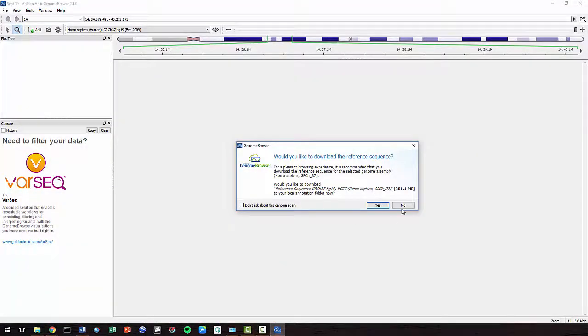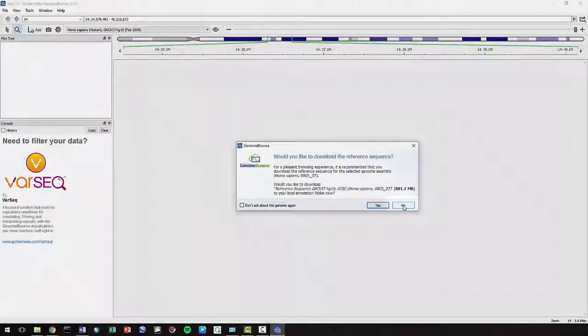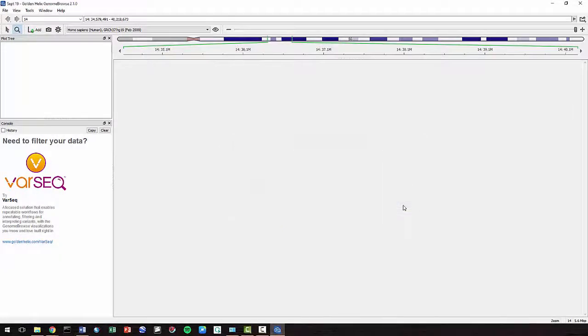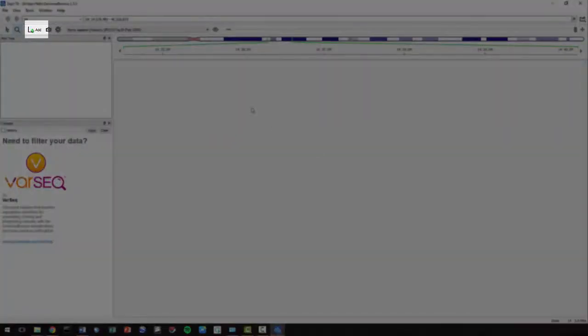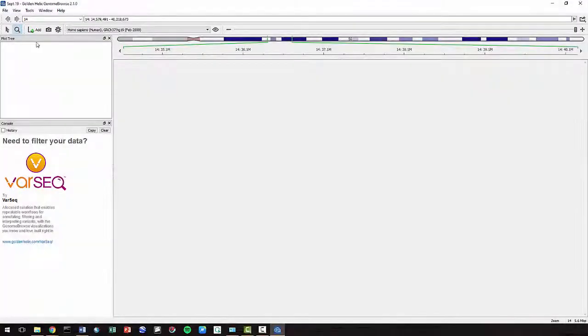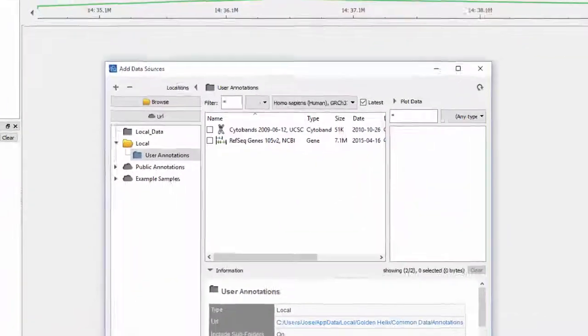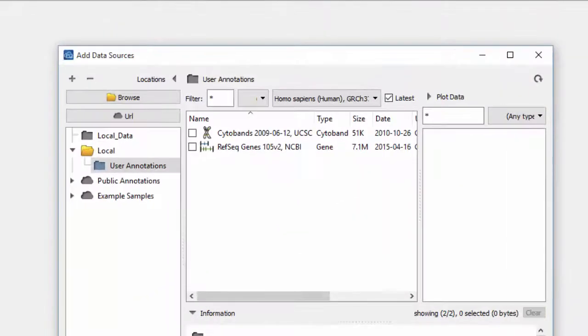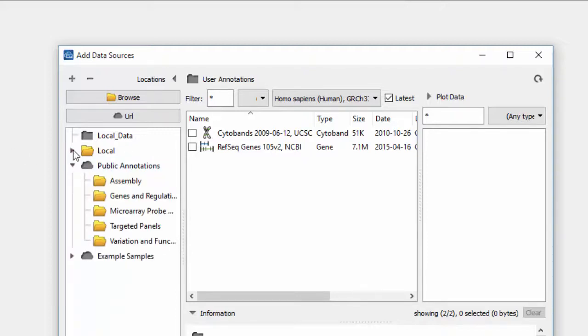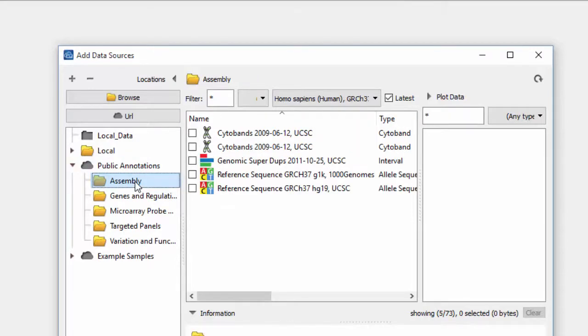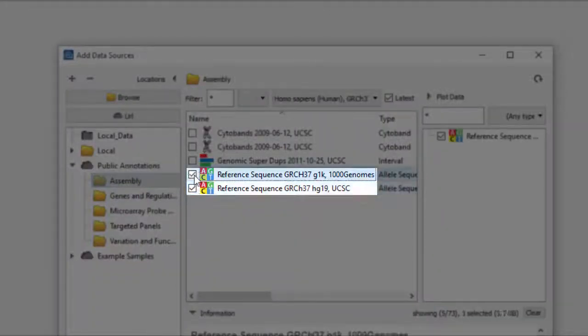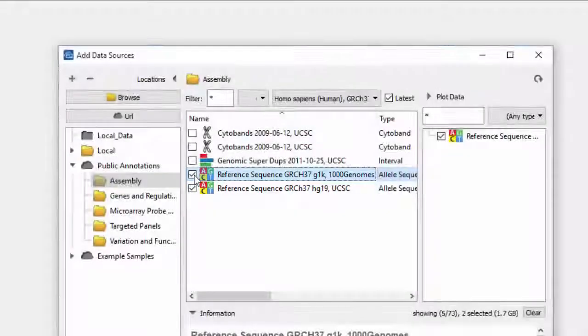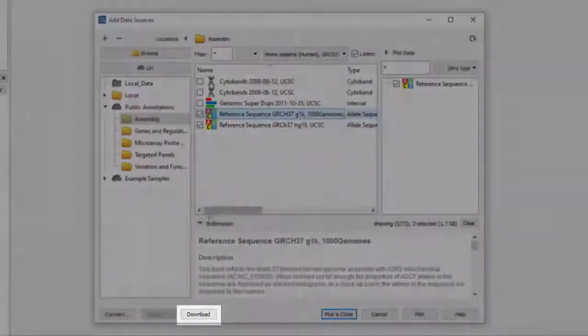Click No on this window, then click Add. We are going to download a few files to our computer. Go to Public Annotations, then Assembly. Select these two files. We'll explain their importance later. Then click Download.